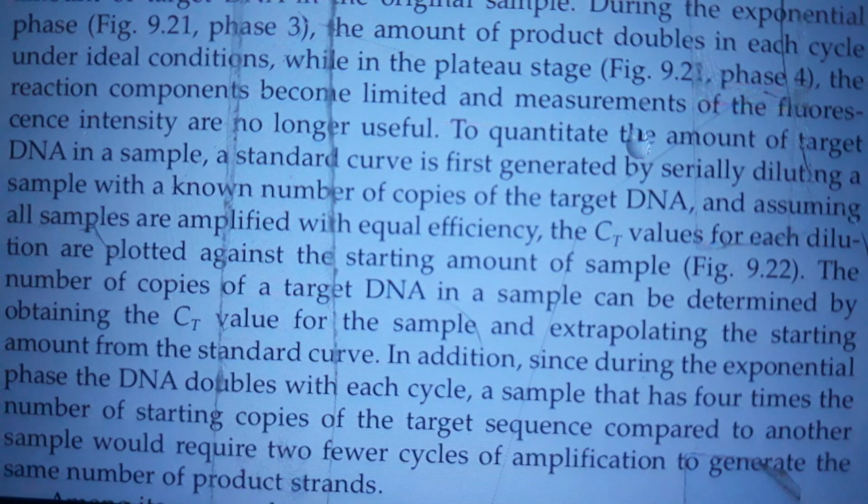To quantitate the amount of target DNA in a sample, a standard curve is generated by serially diluting a sample with a known number of copies of the target DNA and assuming all samples amplified with equal efficiency.